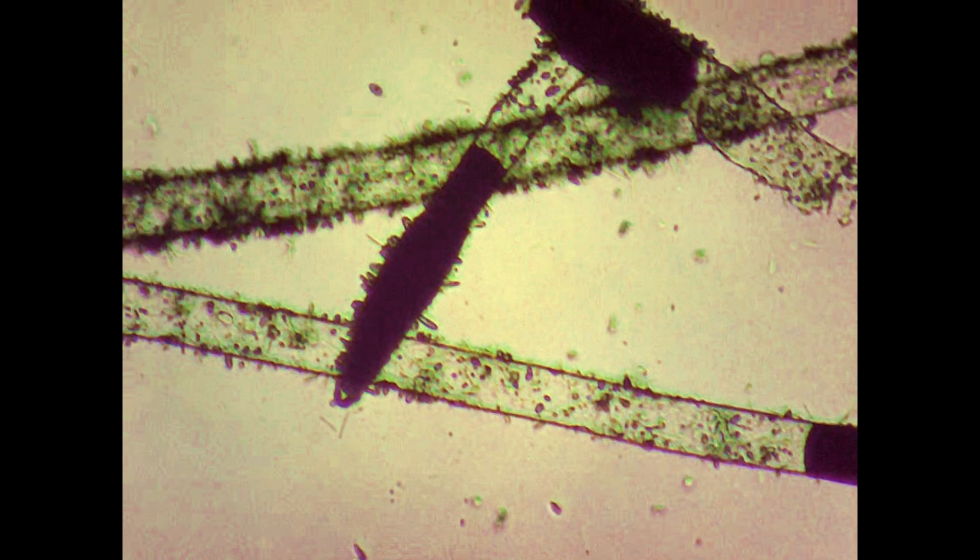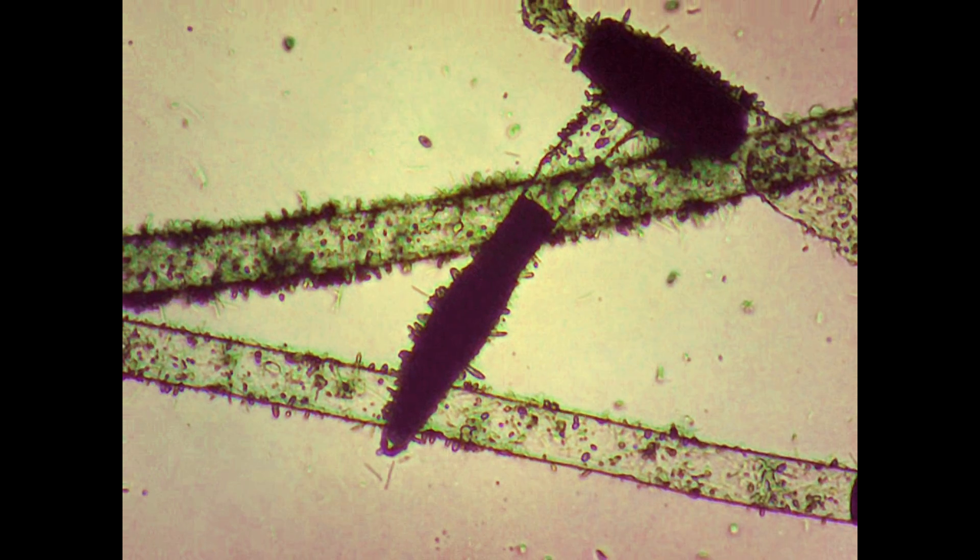Starting at a magnification of 40x, we observe this organism's large filamentous cell structure that seems to be broken up by a dark differentiated cell type.